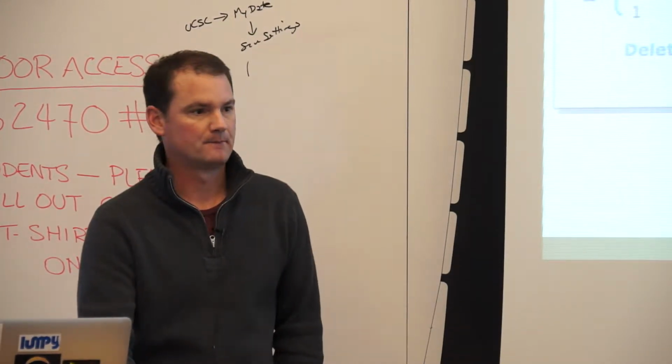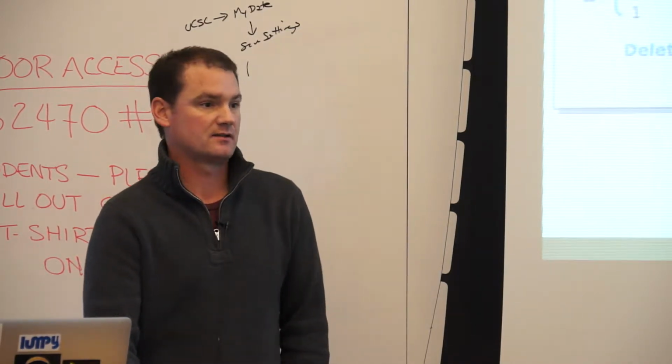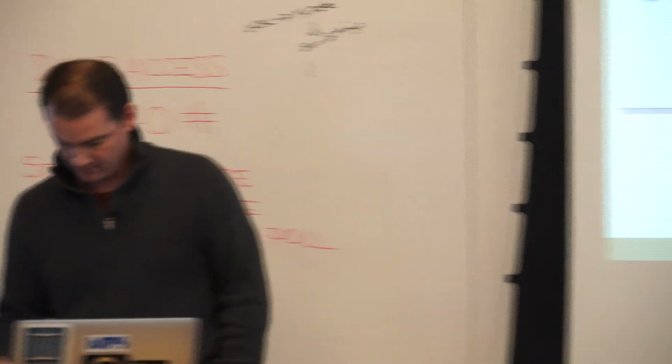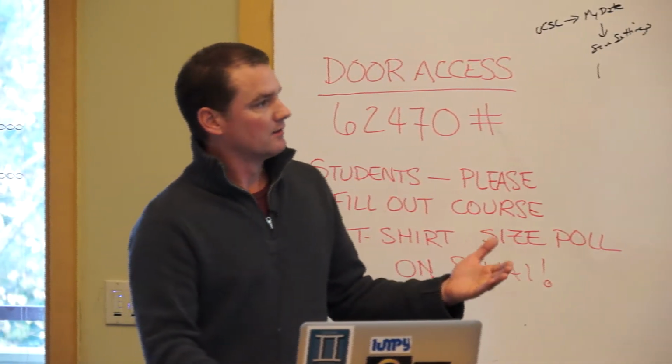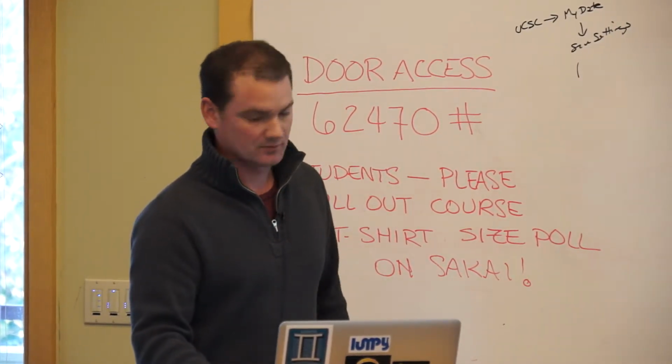Change in amino acid. Yeah, or more broadly, does it affect the gene? Does it overlap a gene at all? Right. That's great, because those are the steps that we're going to go through to add that type of information to answer those types of questions.